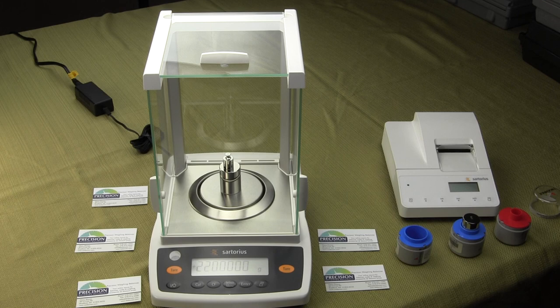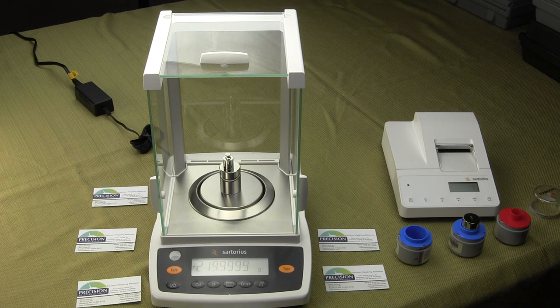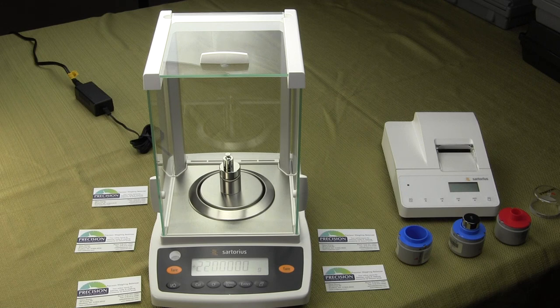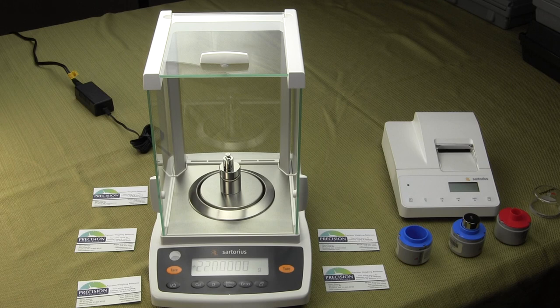The Entris series is now available as of March 2014. This is a brand new model. This is Sartorius' replacement to the discontinued ED and GK series that were discontinued in 2012.